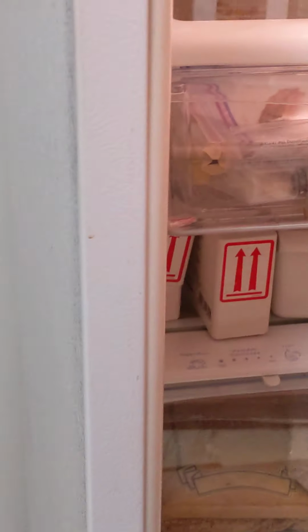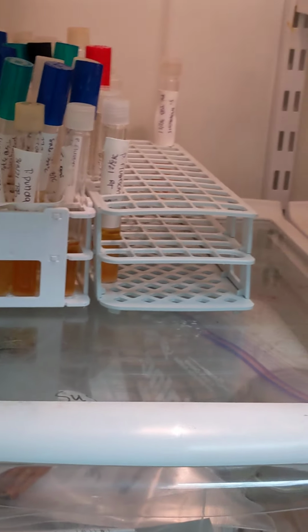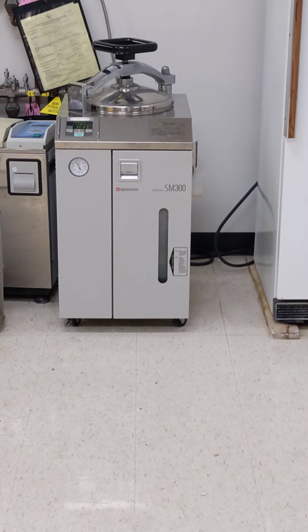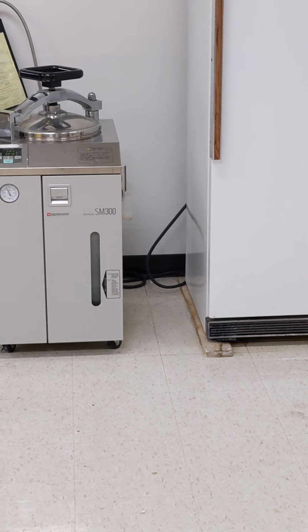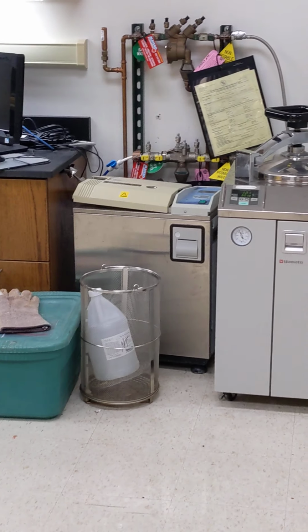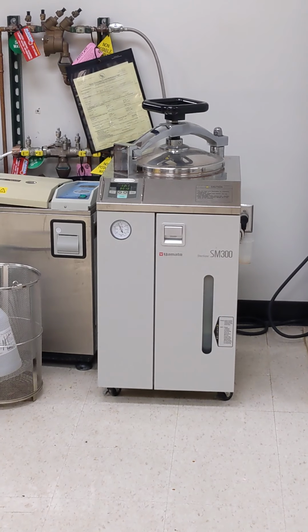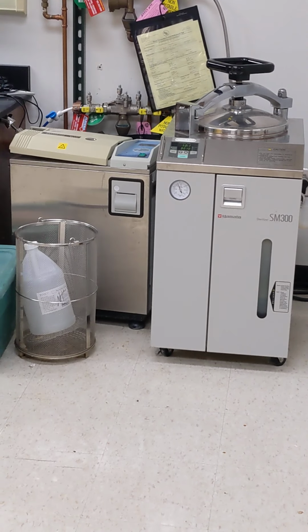So let's say I have a bunch of cultures in the fridge that I need to kill, which I do right now. I've got a rack of them that I need to get in the autoclave. Well, what I would want to do then is probably run that for closer to 50 minutes or an hour. Now, the reason for that is I'm trying to kill off a bunch of known microbes. In contrast, here I'm trying to sterilize the ingredients, so 15 to 20 minutes is plenty. So the amount of time that you use is really based on your purpose and what is actually present on the media.